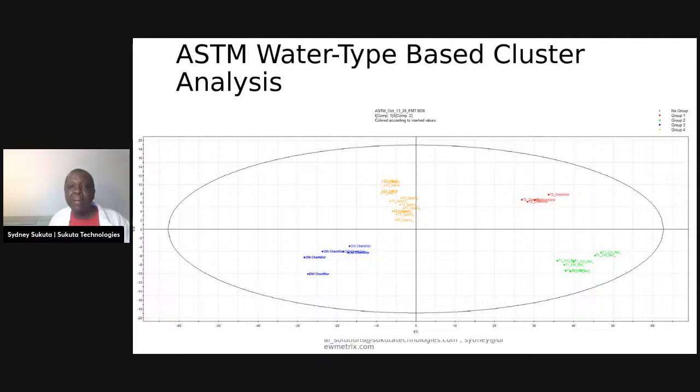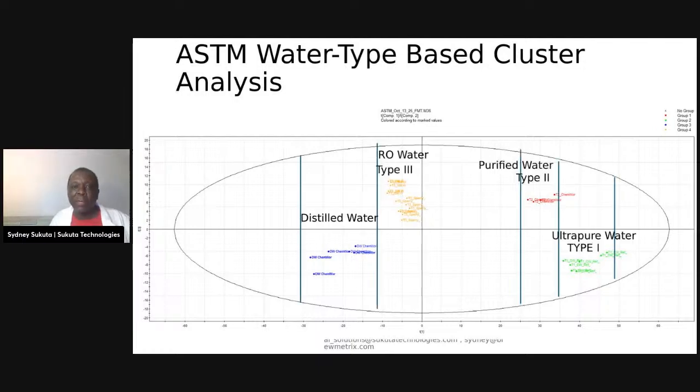So you can run the water you have to make sure it lands where RO water is, if you want RO water. Some people may want purified water. I understand brewers like to use this RO water or type 3 ASTM water. I think this is more clear than the other one. This is the knowledge we acquire during machine learning or data exploration, and then we code it and put it in the server, and then we can have automatic classifications.